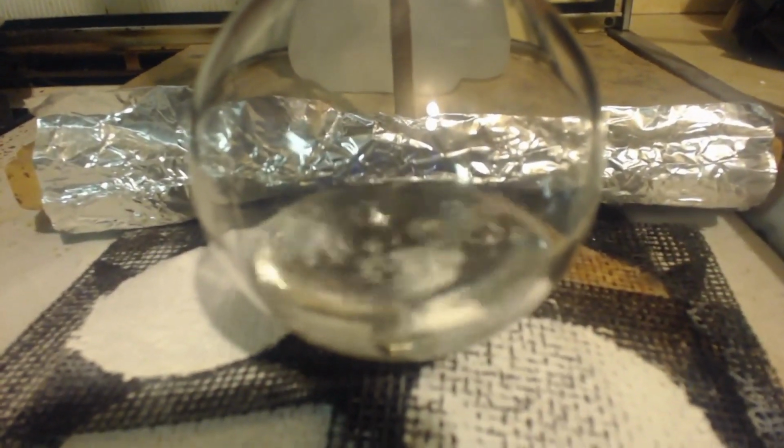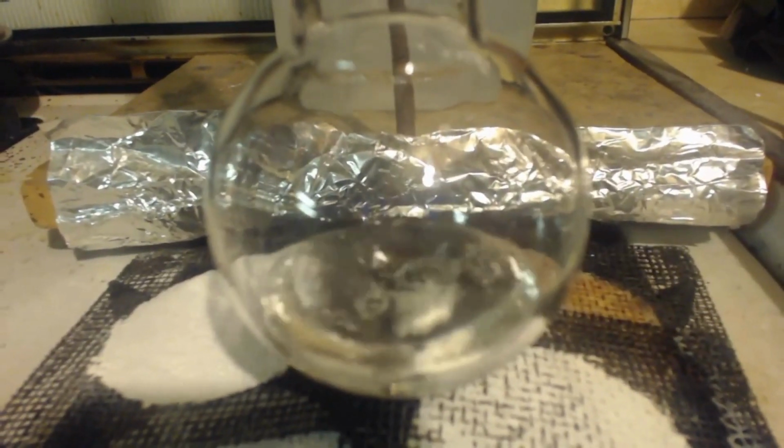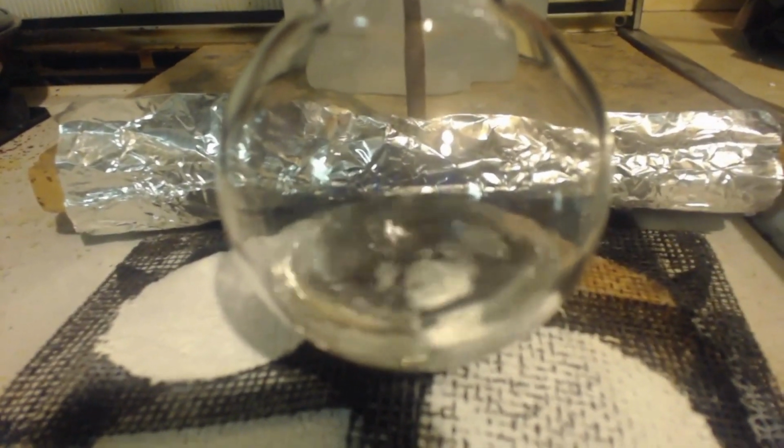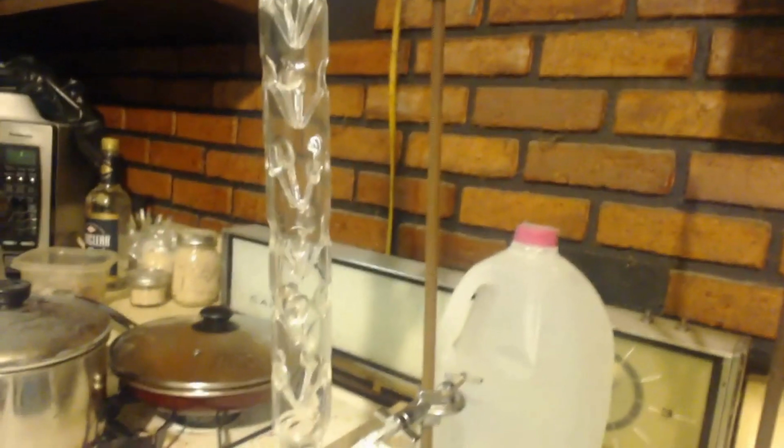I just wanted the experiment over, though. We'll see how much. I'd be happy if I got like a 10% yield or something like that. But we'll see. I got a bigger X column on there, so, you know, get better separation.